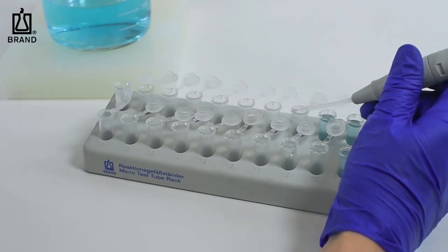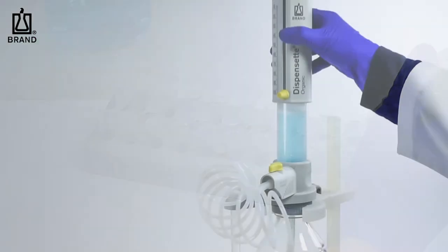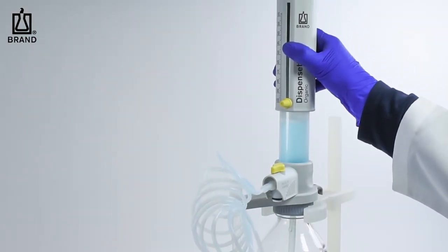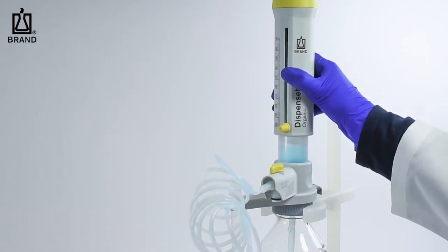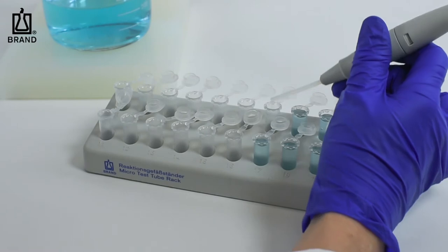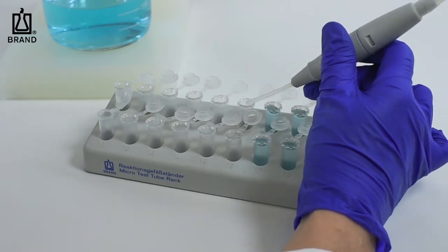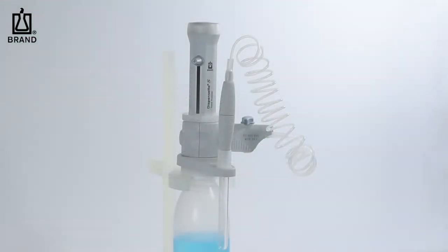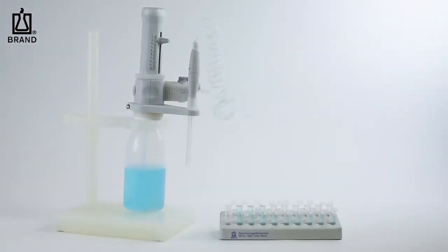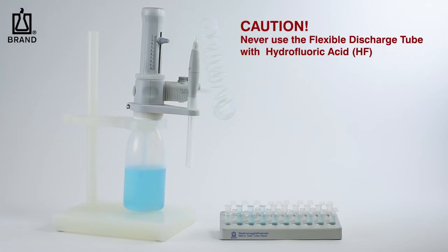tubes or scintillation vials. With the Dispensette S and Dispensette S Organic, the low operating forces of the floating piston design allows you to operate the dispenser with one hand, freeing up the other to move the discharge tube from tube to tube. The use of a bottle stand is recommended for all Dispensette S models to stabilize the bottle during one-handed operations. Remember, the flexible discharge tube must never be used with hydrofluoric acid.